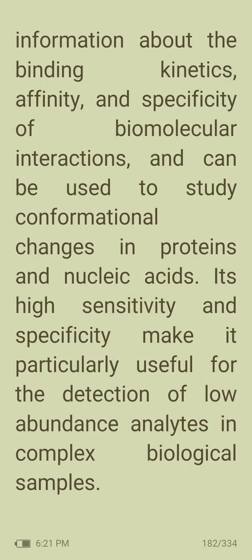It can provide information about the binding kinetics, affinity, and specificity of biomolecular interactions, and can be used to study conformational changes in proteins and nucleic acids. Its high sensitivity and specificity make it particularly useful for the detection of low abundance analytes in complex biological samples.